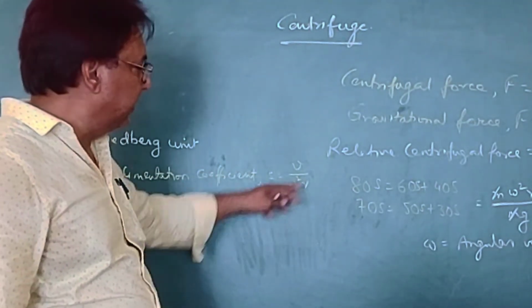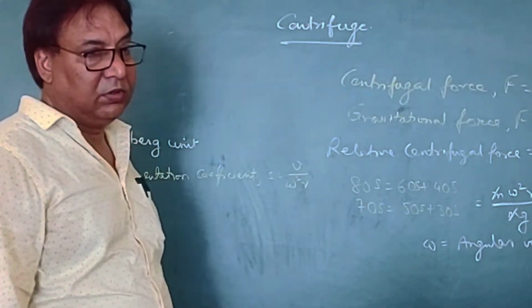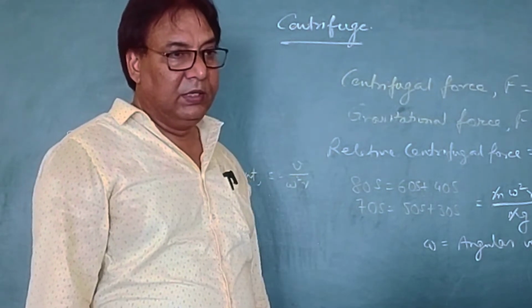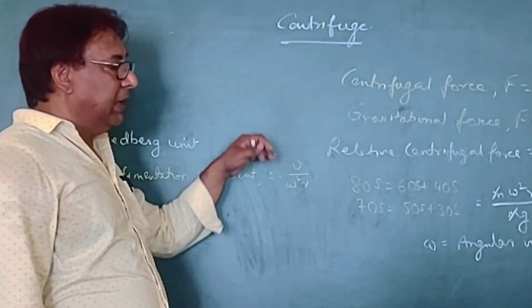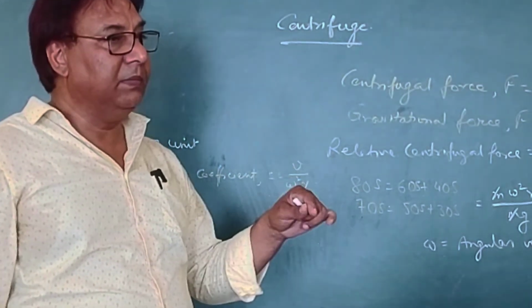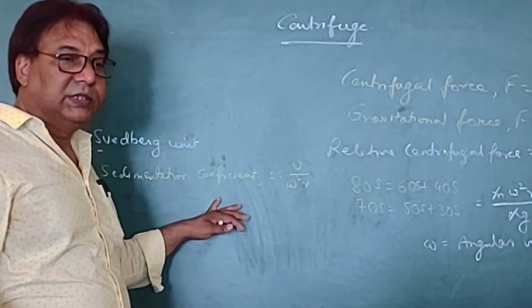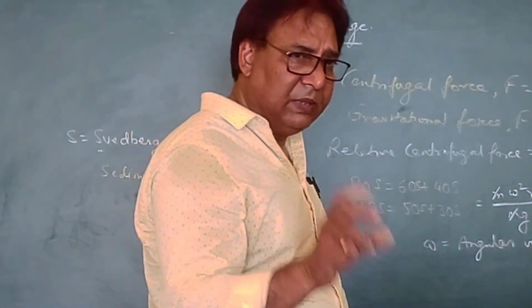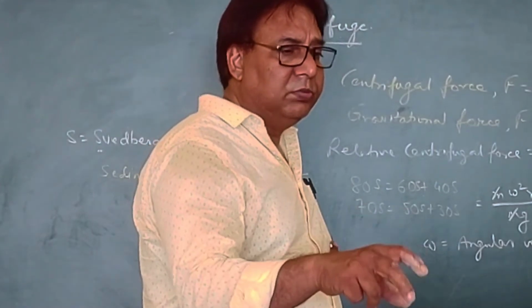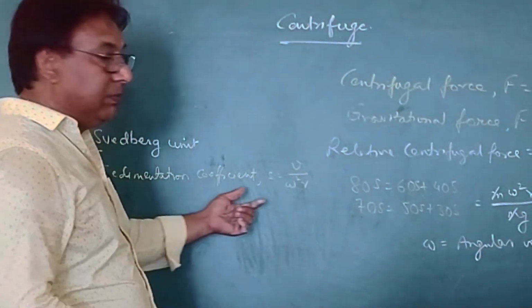According to Stokes' law, you can replace this V with the right hand portion of the Stokes' law equation. So to make it simple, when you are talking about a particle sedimenting in a medium, you can directly go to this formula. You can skip that middle part. To make your answer a little bit simpler, if you have trouble remembering Stokes' law, then you can directly jump to this.